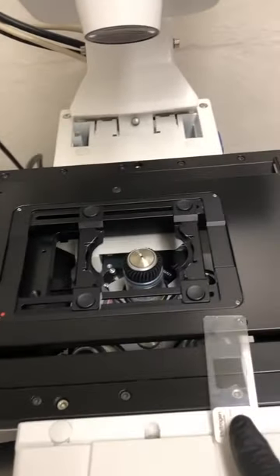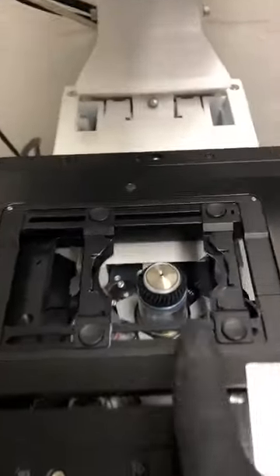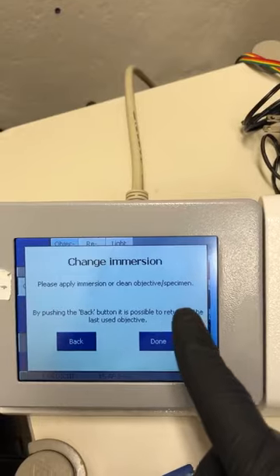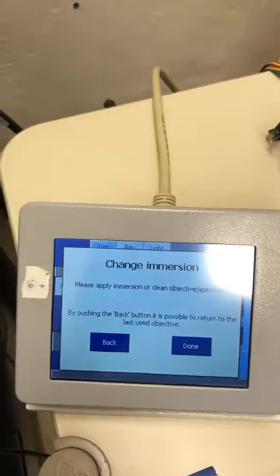I've removed the sample and switched to the 63x oil objective by pressing the proper button on the touch beam. When I did, it says 'change immersion — please apply immersion or clean the objective specimen.'